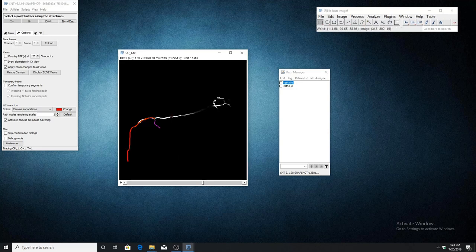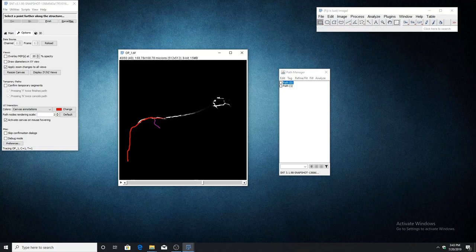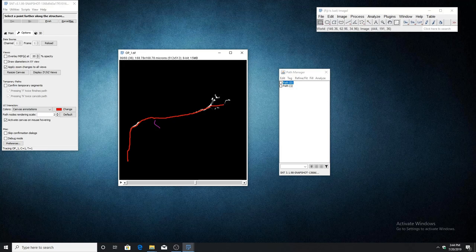Once I click this, the path will turn red, indicating that it is now a temporary segment. We can continue tracing like before by clicking along the structure until we reach an endpoint, then press F on the keyboard to finish the path.